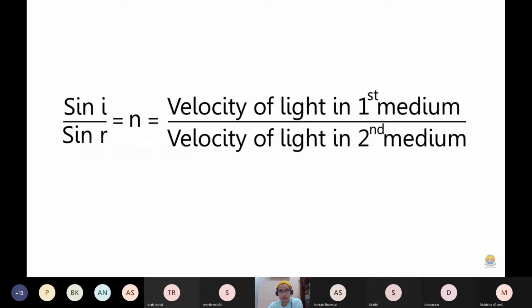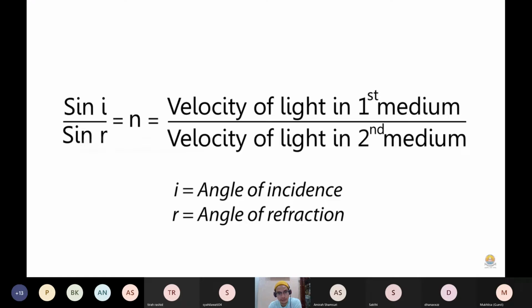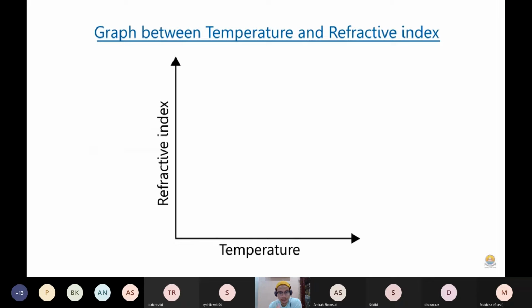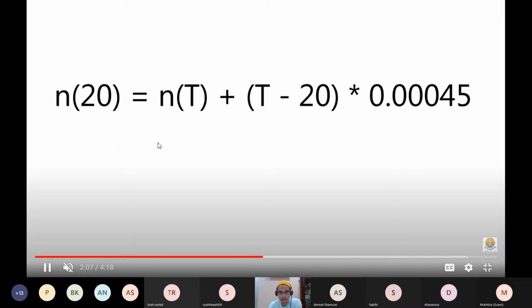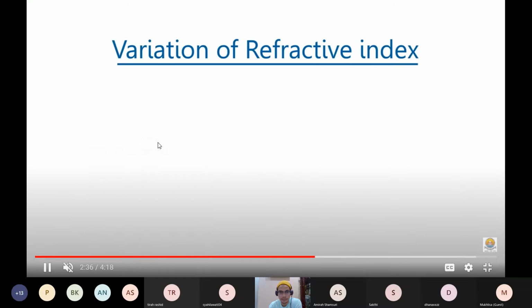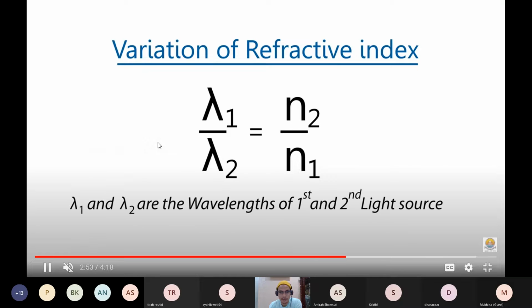So if we use the instrument, we do not need to do this calculation because the instrument itself dah is set up to give out the reading with the meter yang dah tersedia. Okay, so dalam video ni dia just explain how do we get the final reading, how do we get the index. Saya akan skip kepada dia punya instrument.